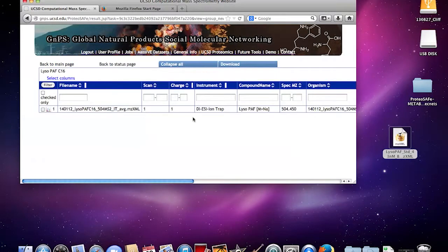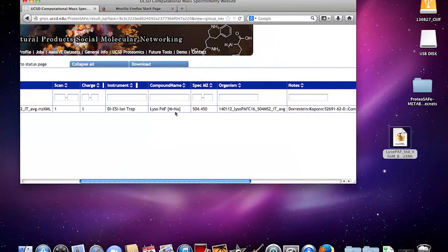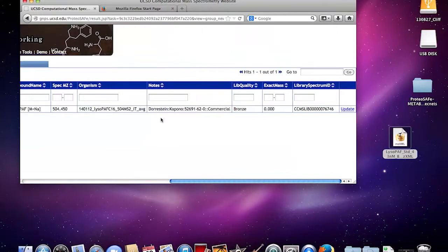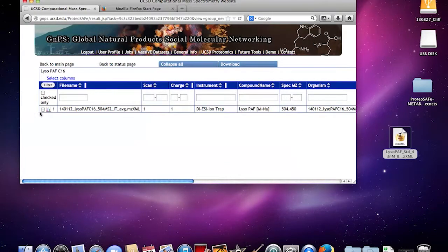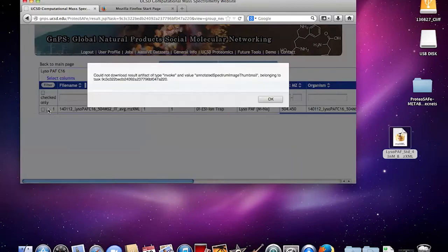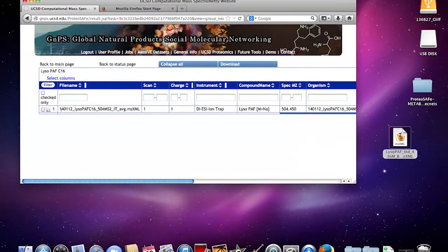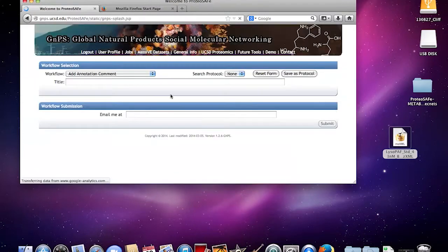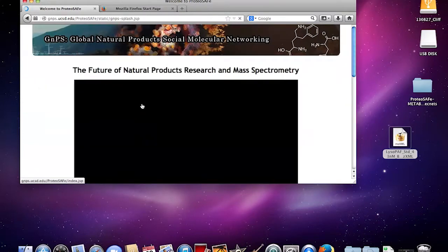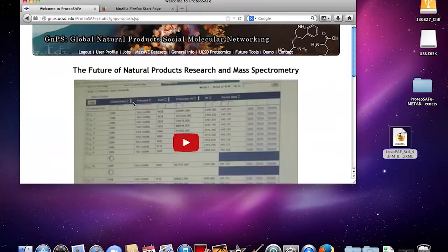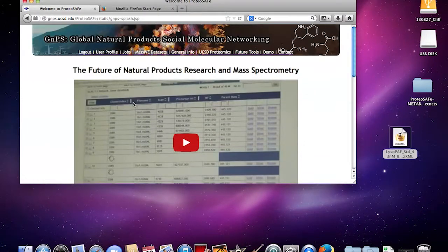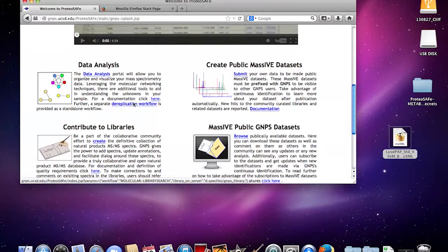Then you're going to want to view this in the new library. In this case this was a sodiated adduct that I uploaded earlier and you're going to want to update this. You can check it on here. We're going to update it and then it should be updated. Now these files should be incorporated into the library.